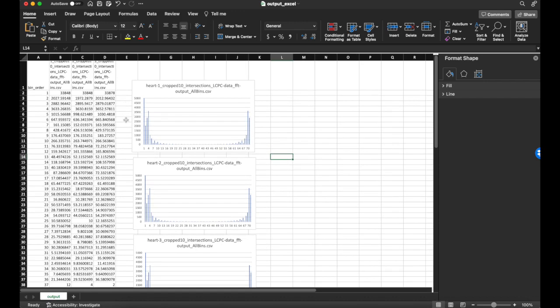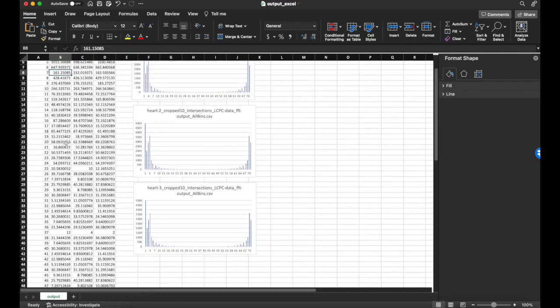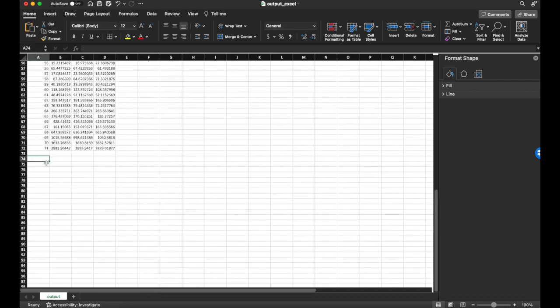So now let's talk about how to calculate an index. Each of these samples has 71 values, and that's multi-dimensional and complicated for the human mind to assess. And so we want to derive scalar values, that is single numbers, to represent each shape. The simplest one, let's go to the bottom, is to calculate an index called sum all bins, so we add up all bins in all rows to get one number.